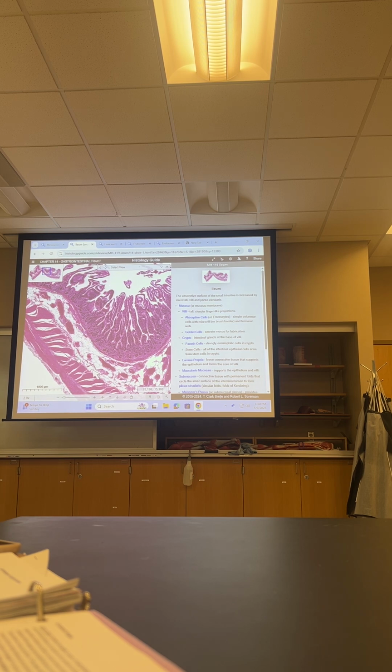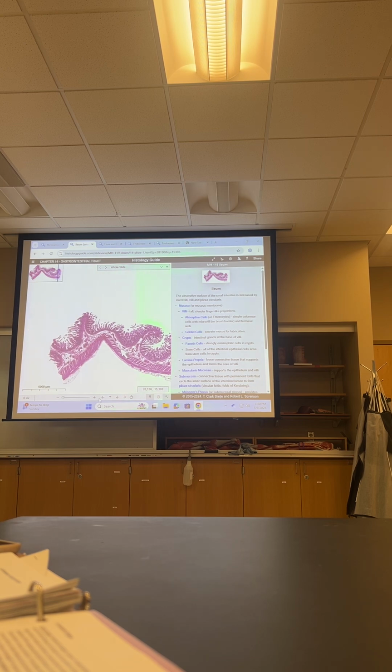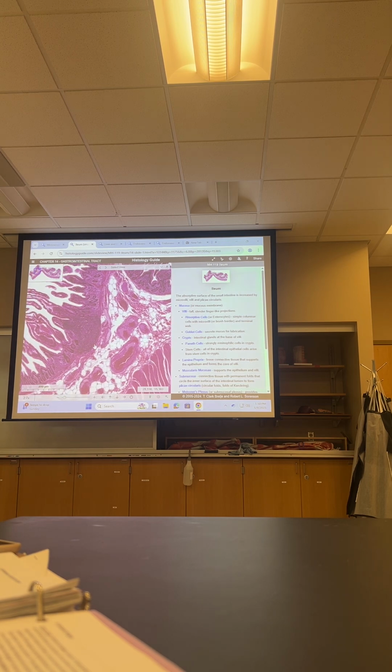Here's the submucosa, the muscularis externa, and then the serosa down here. And let me find a Peyer's patch in this one so you can see it. There it is, there's one right there. So a big purple structure within, up near the mucosa, are the lymph nodules or the Peyer's patches. And actually on our slides, these are really noticeable. Like there's a whole bunch of it in the slides.